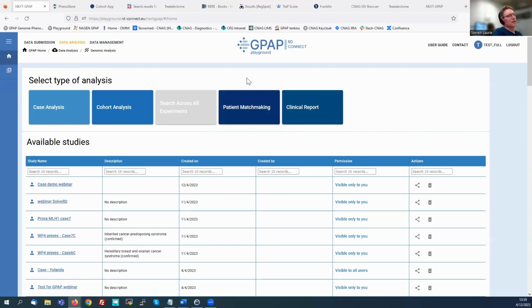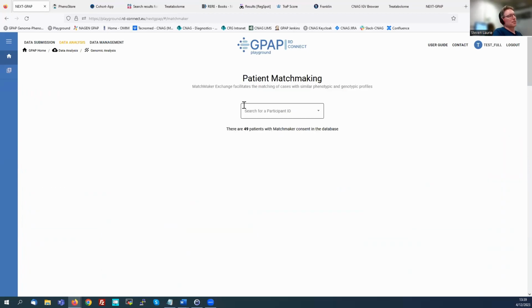So in theory, it is a live search, I guess. Yeah, in that specific moment with the HPOs that we have and the HPOs that are in the other databases. So it's live in the sense that it's that specific moment with the data that is available in the system when you launch the query. I don't know if that was the specific question.